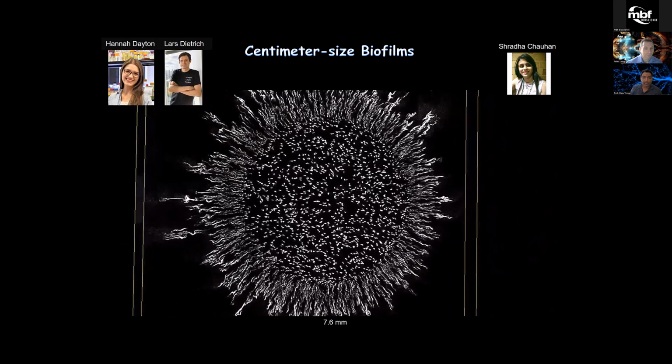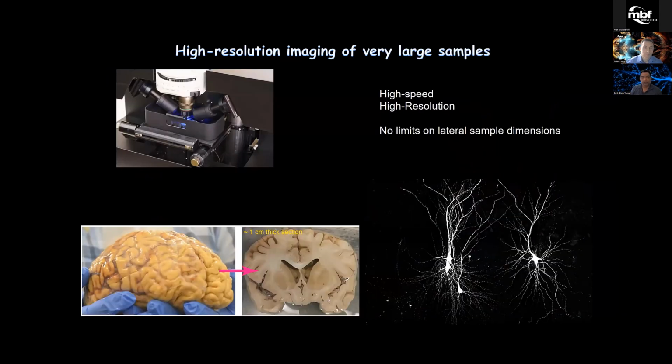All right, so with that, we'll just sum up. So try to convey that this variant of light sheet microscopy, light sheet Theta microscopy, which is implemented as ClearScope, the next generation of it, allows us to do high resolution imaging of very large samples. So essentially no practical limit on the lateral dimensions of the sample, only limited by the travel range of the stages. It's compatible with multiple types of tissue clearing method without having to do any hardware change.